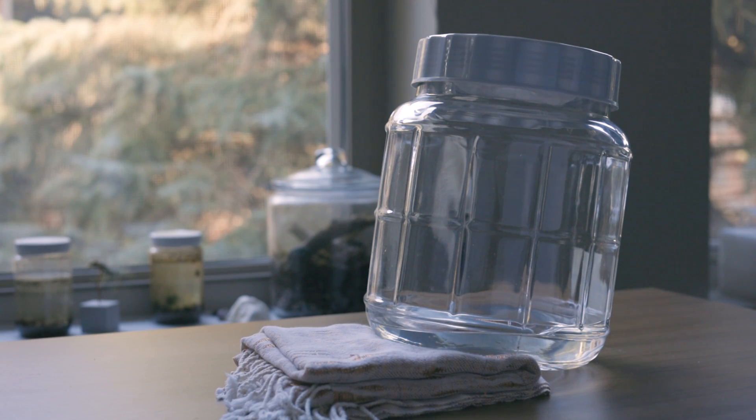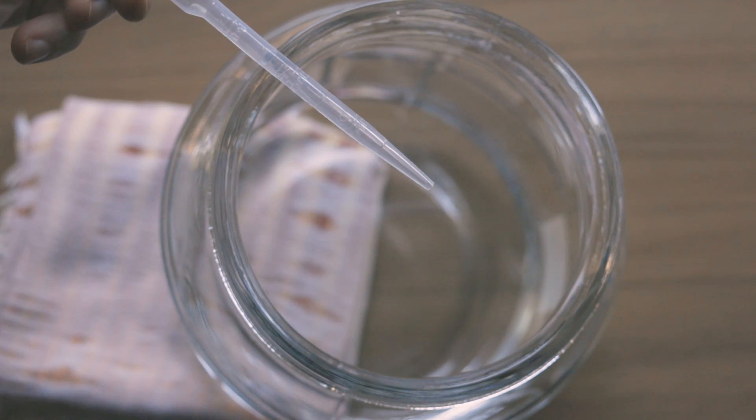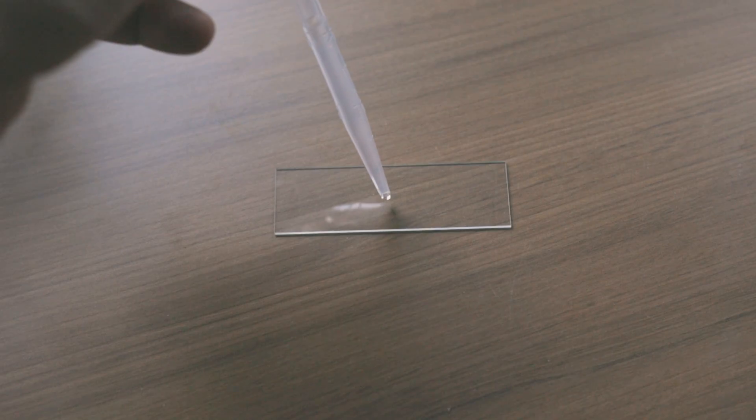I placed the jar at an angle, so the particles gathered at the bottom are more concentrated. Would you like to see what's in a drop of rain water? Let's find out!